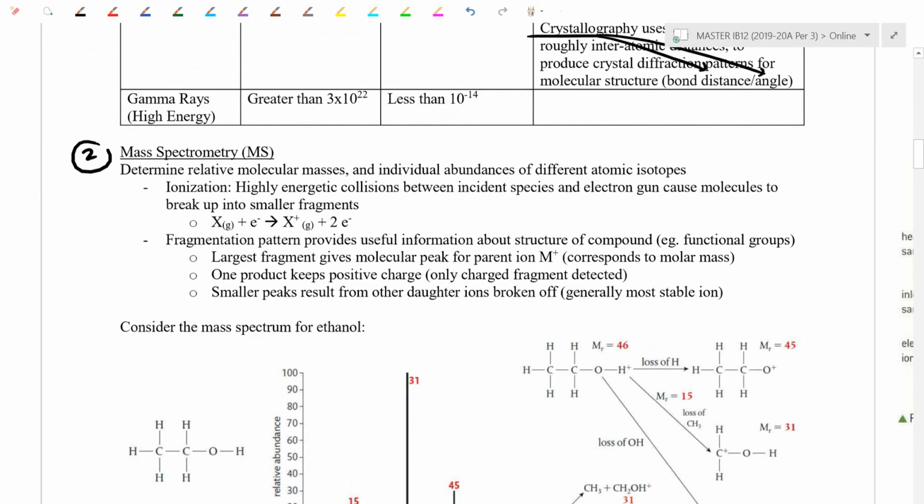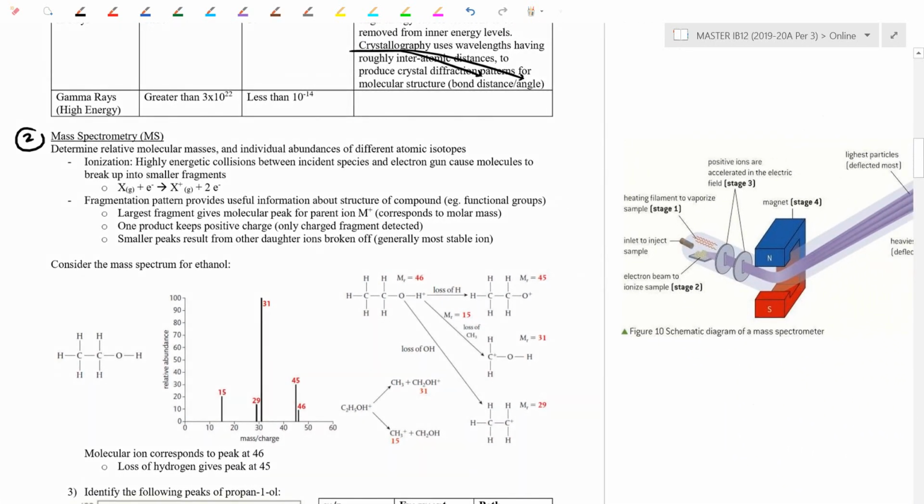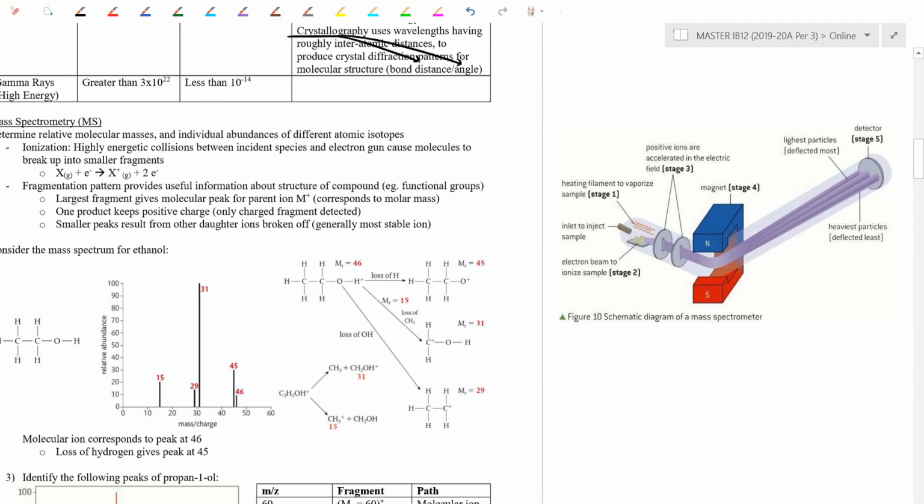We're going to start off with mass spectrometry here. There are different types of mass spectrometers. We can have gas spectrometers, liquid chromatographers, things like that. But for mass spectrometers in general, I pulled the diagram from chapter 2 again here. Although they say in the new curriculum you don't need to know all the steps again, I'm just going to quickly overview it with you.